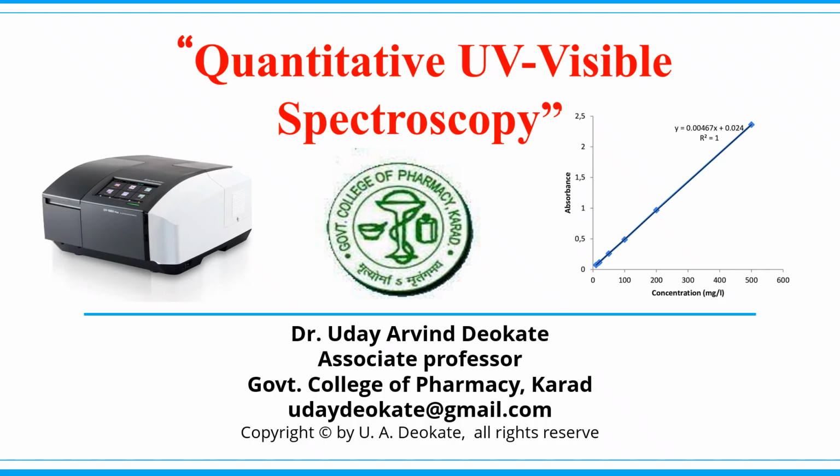Many times the researcher or the student who is doing the practical in laboratory faces problems in quantitative UV visible spectroscopy, in finding the concentration of unknown and in preparation of the calibration graph. So all this part will be covered under this lecture.